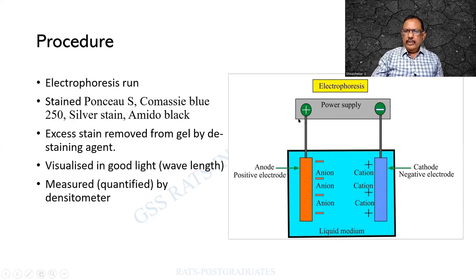So look at this one. There is a power supply, positive and negative. There is a movement. There is a positive charge and a negative charge, etc.